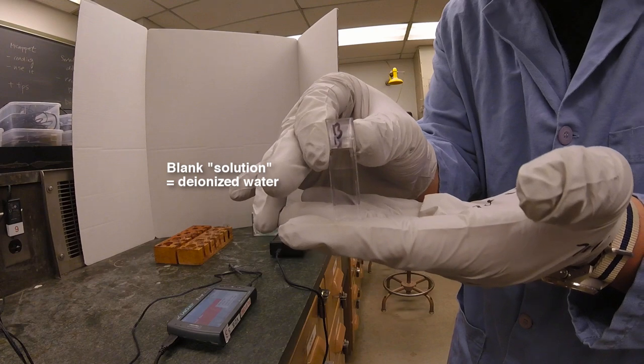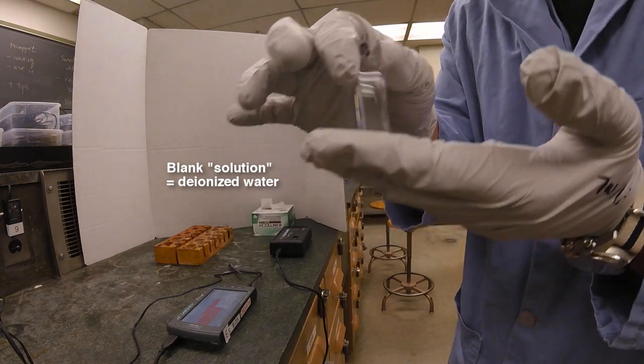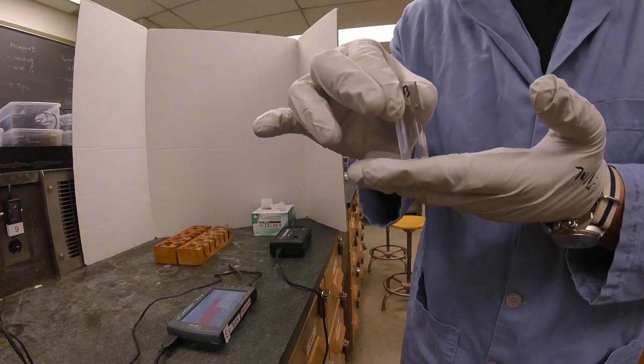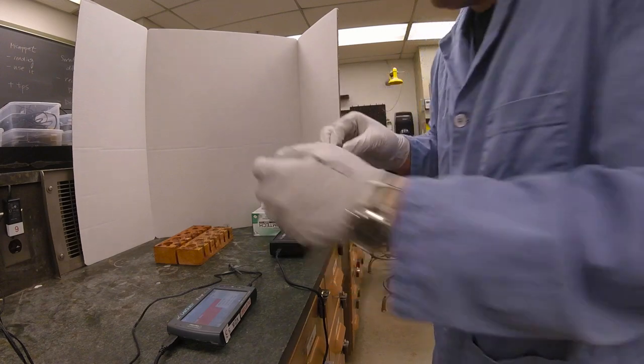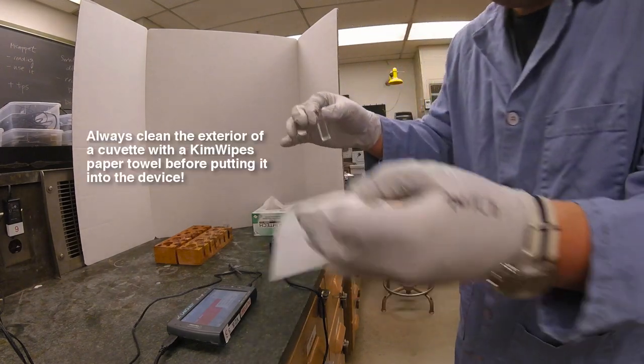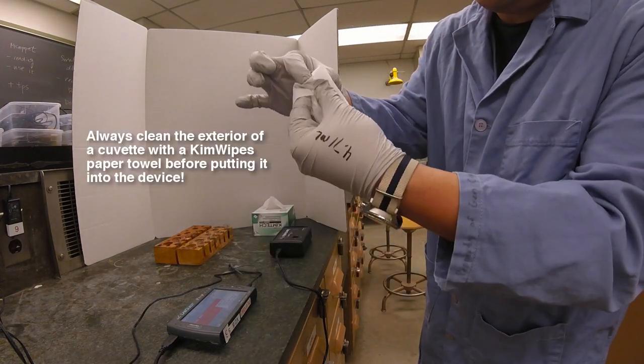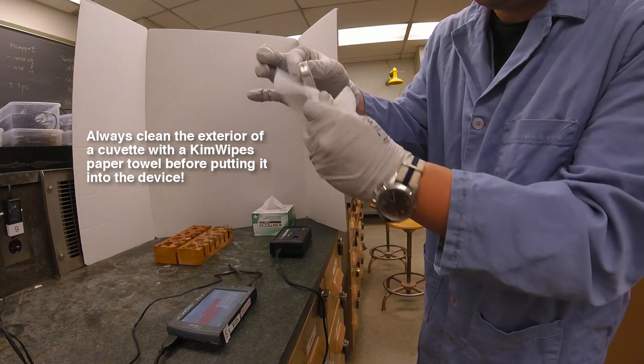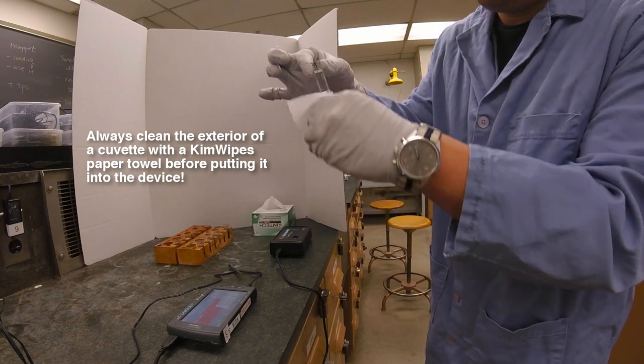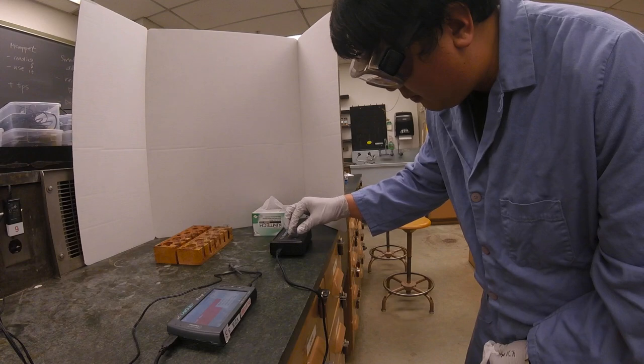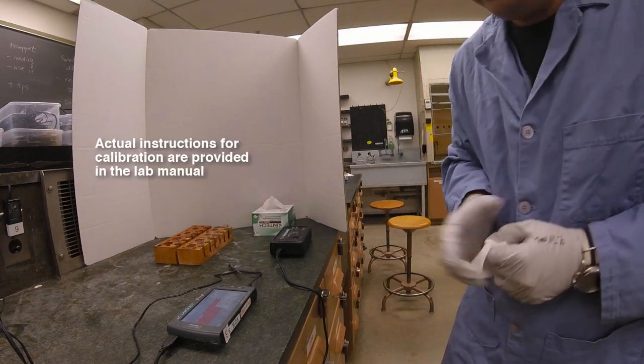The blank is a cuvette marked with B. Before putting any cuvette into the spectrophotometer device, you want to wipe it to make sure there aren't any interferences with the light source. Now I'm going to calibrate it.